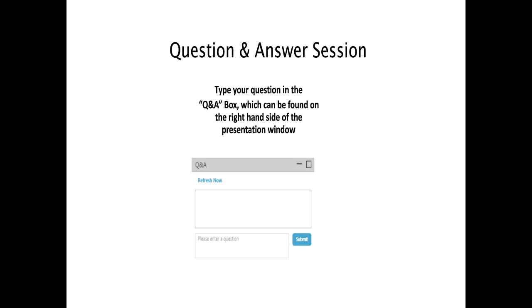We advocate for any column, and I think I can speak for any column manufacturer, depending on what the column is used in, if it's used with any additives, ion pairing reagent, obviously in reverse phase, those can certainly be used practically when the mobile phase is flowing through the column. But we would always recommend to remove any additives, cleaning the column of additives and putting it on the solvent that is recommended by the manufacturer.